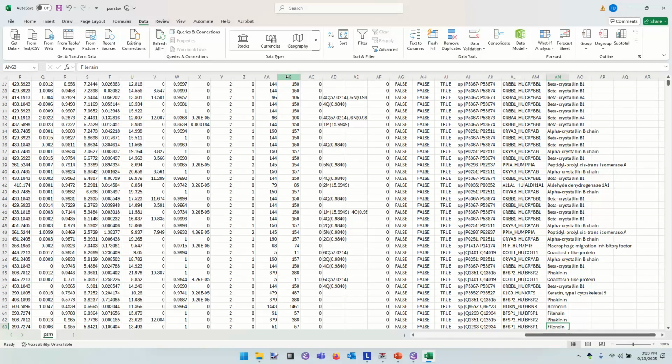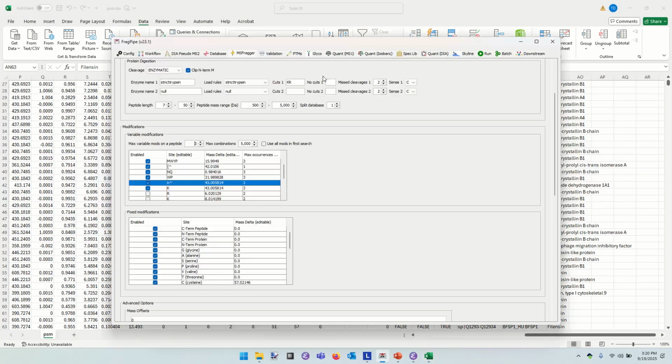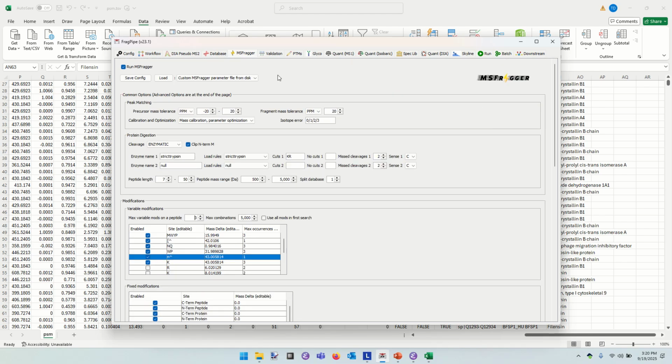Once you allow for open modifications in a range of, I think, -150 to 500 Daltons is what we had in this case. So the glyco aspect of this would use libraries of glycans, and they range in size from, for instance, a mannose weighs like 167-ish.